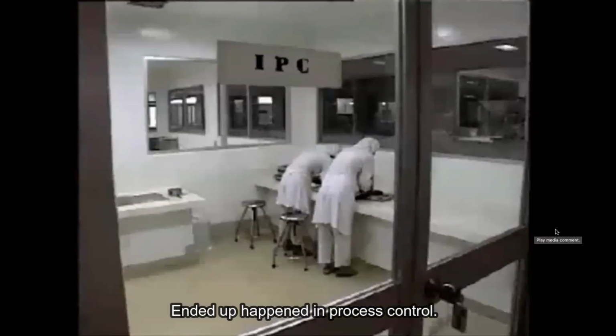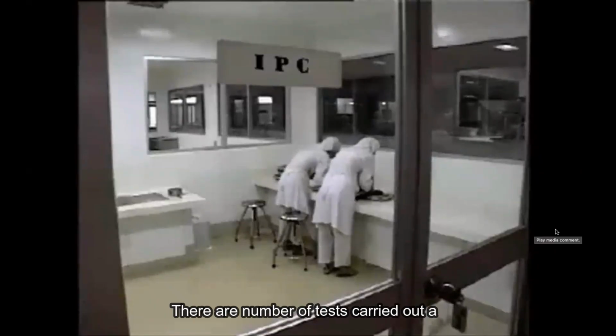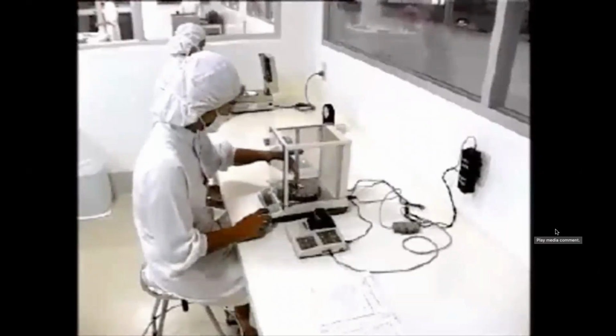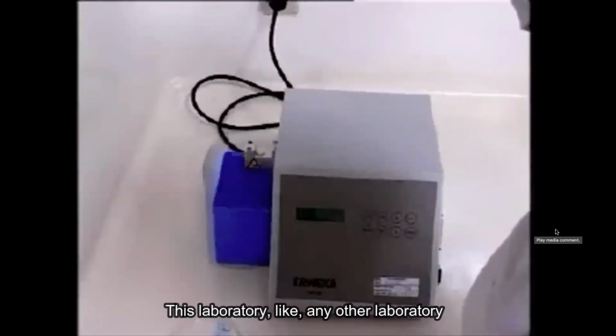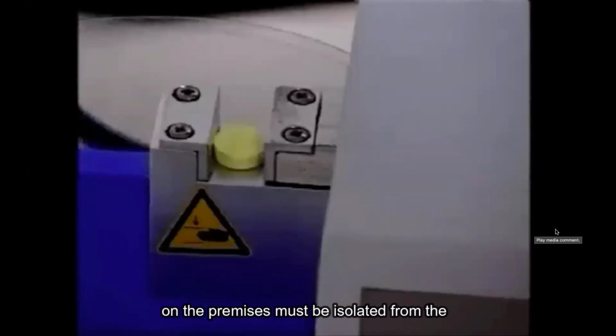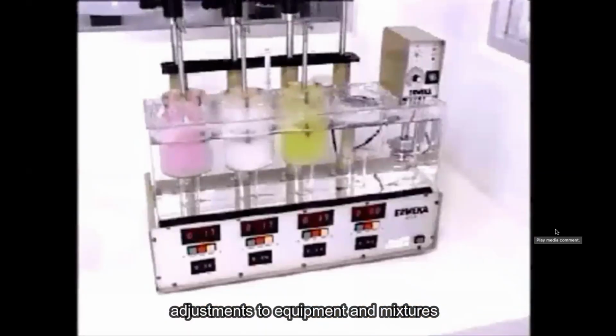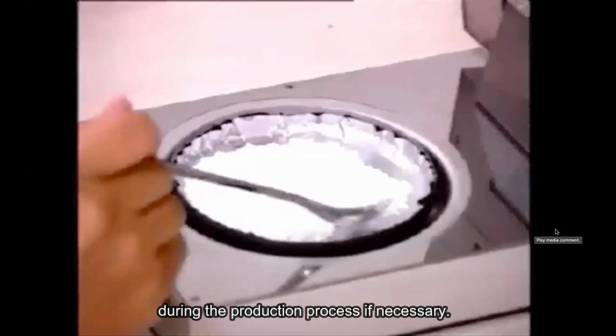In the department in-process control, there are a number of tests carried out at regular intervals throughout the production process. This laboratory, like any other laboratory on the premises, must be isolated from the production areas. The tests carried out here allow for adjustments to equipment and mixtures during the production process, if necessary.